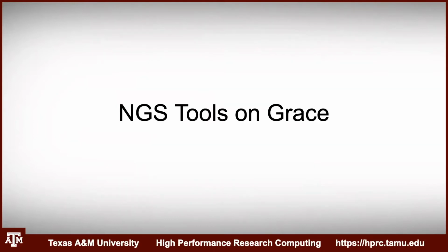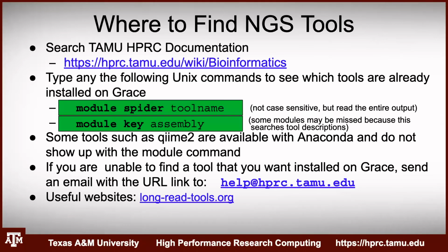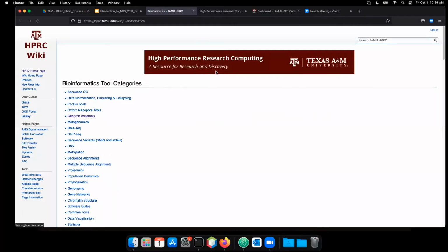So there are a number of tools available on Grace. So where to find these? There are different ways to do this. So first, let's try this link here.